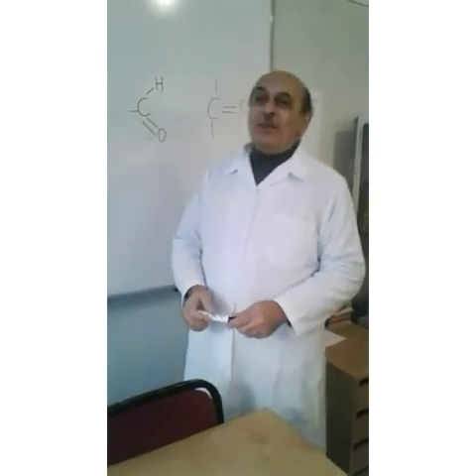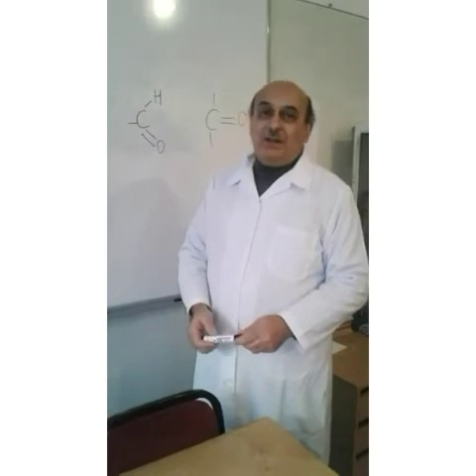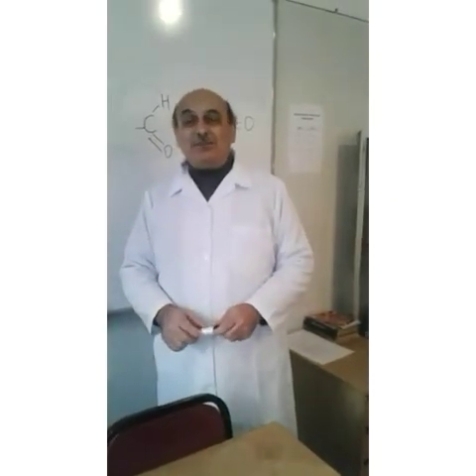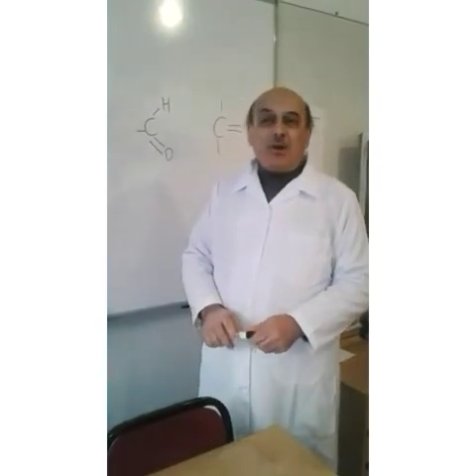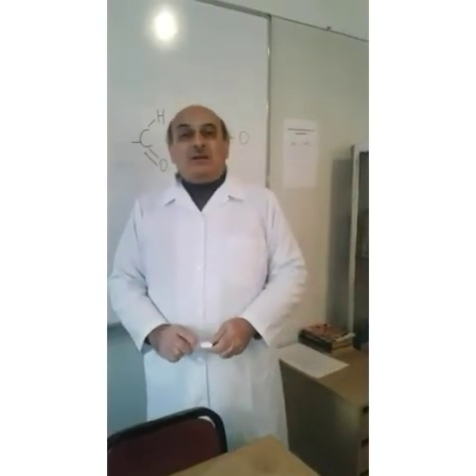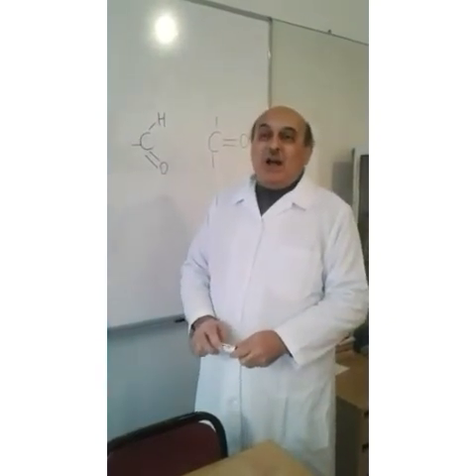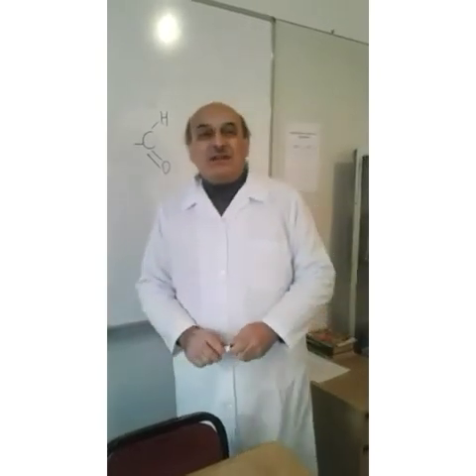Dear friends, we're in the laboratory of UTECA, University of Technology of Azerbaijan in Ganja City. We will continue our experiments to identify chemicals in foods. We will determine carbohydrates by the method of Bertrand, also known as the permanganate method.